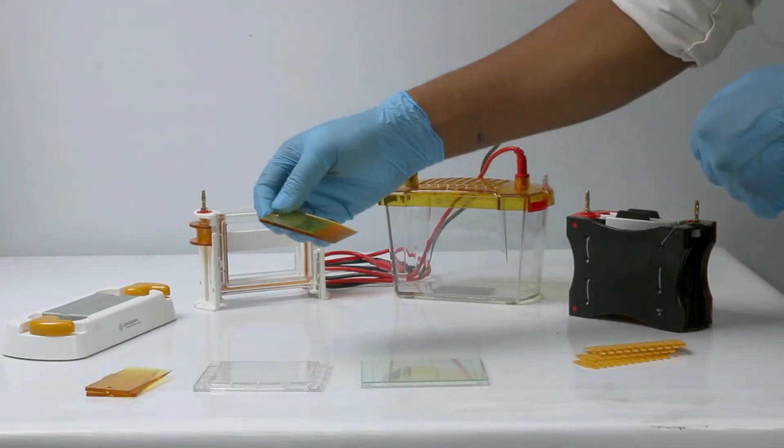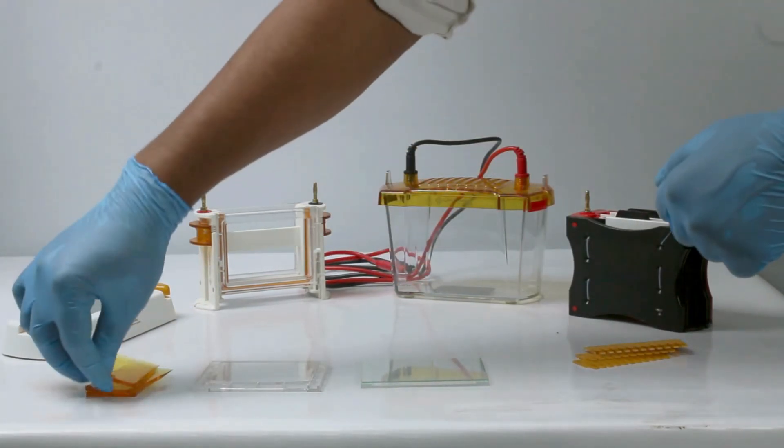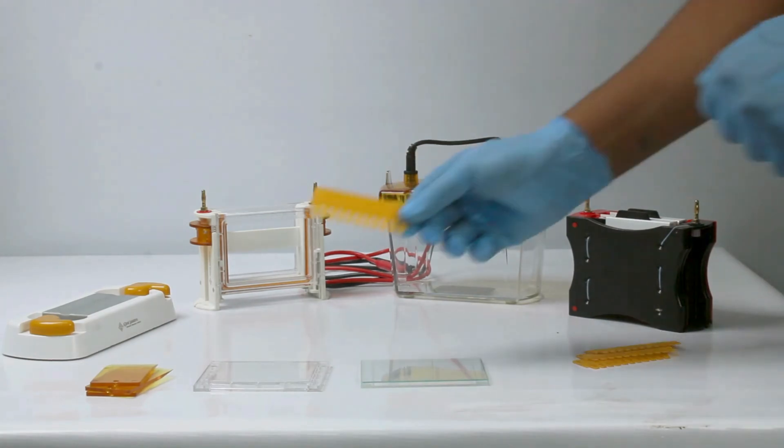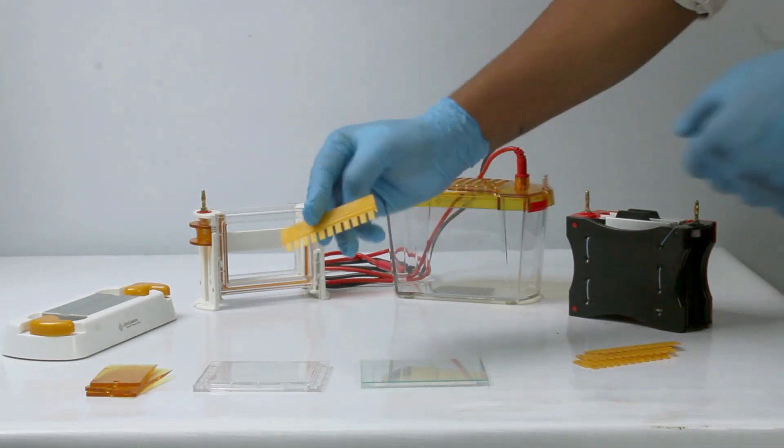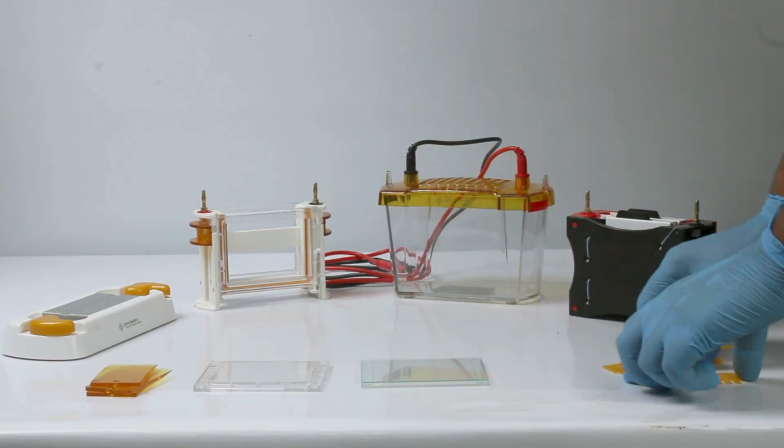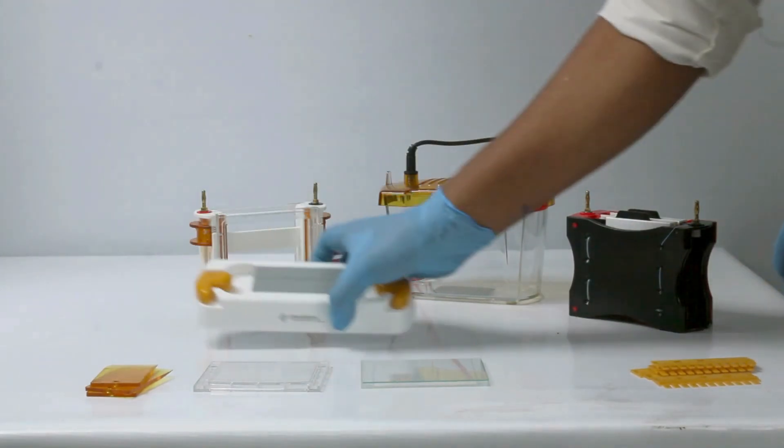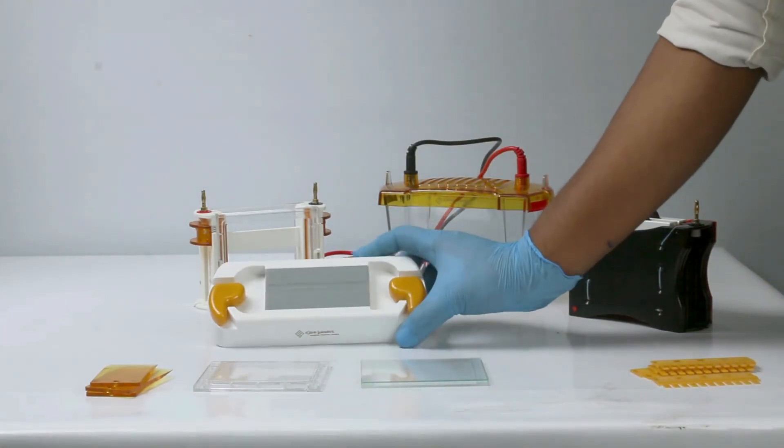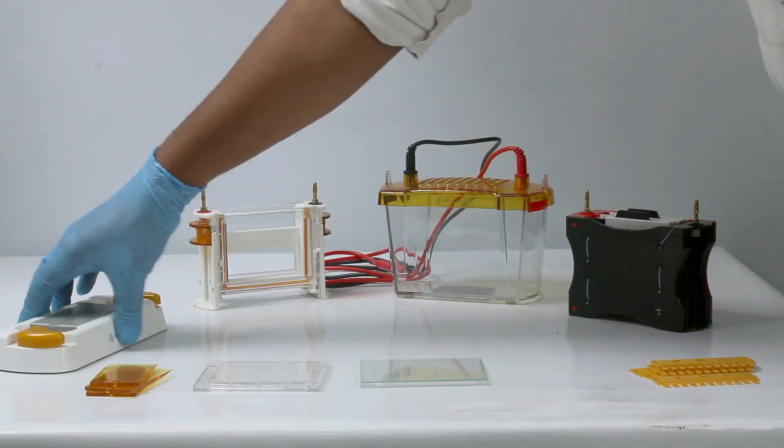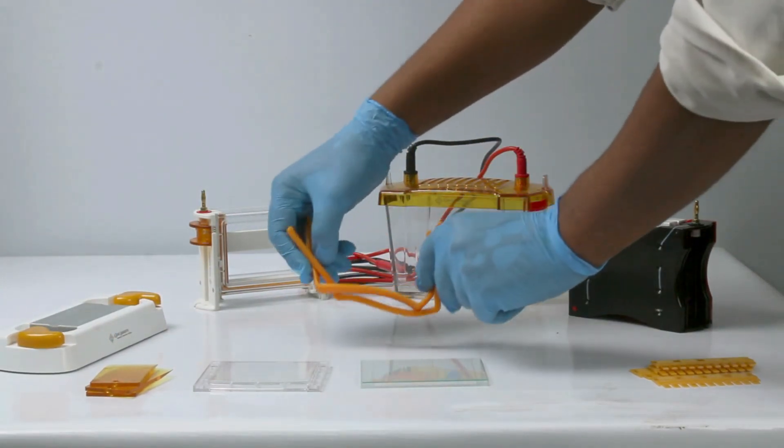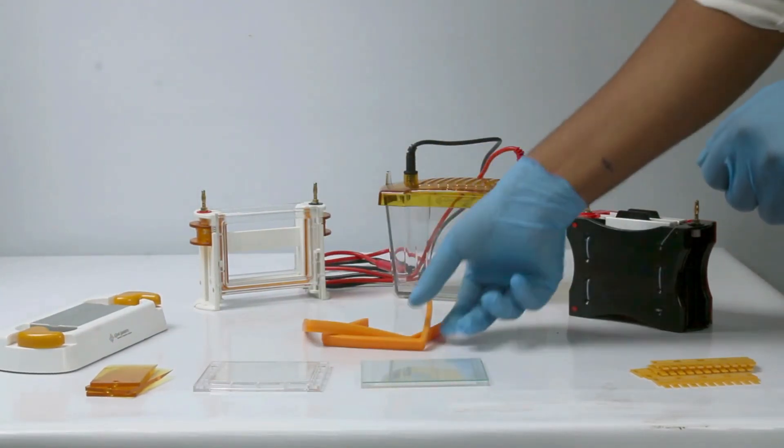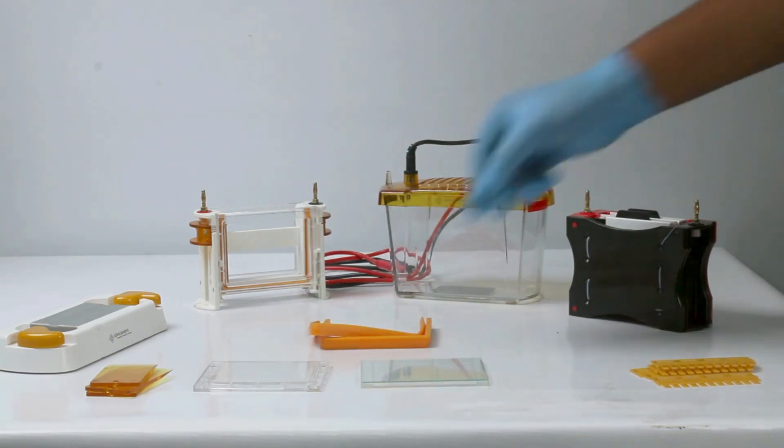This is the gel cutting card. We also provide two combs of 1.5mm thickness and two combs of 1mm thickness designed to create uniform samples. This is the gel making base. Additionally, we provide two fabricated gel seals to simplify the gel making process.